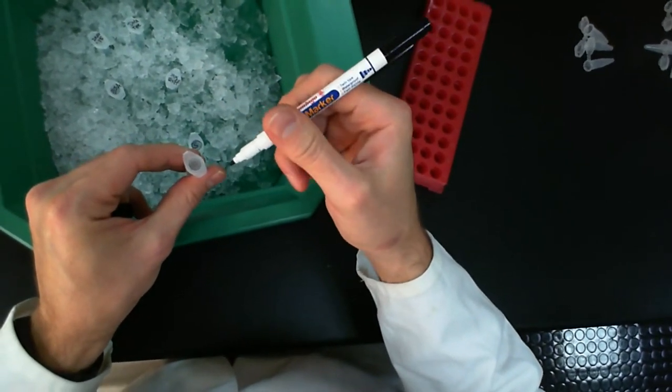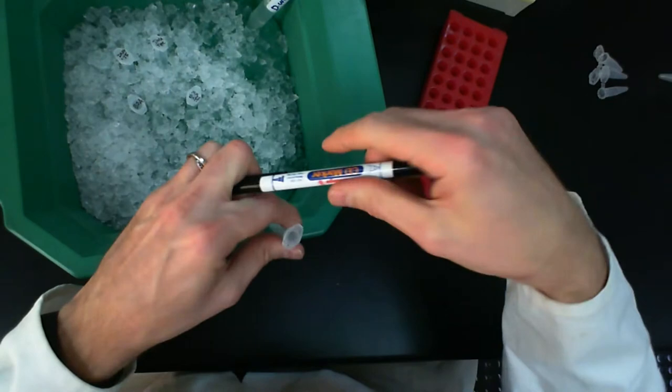Is this the wrong tip? This is the tip that's dry? Yeah. Okay, let's try the other tip.